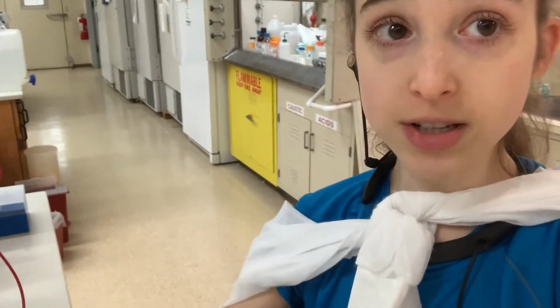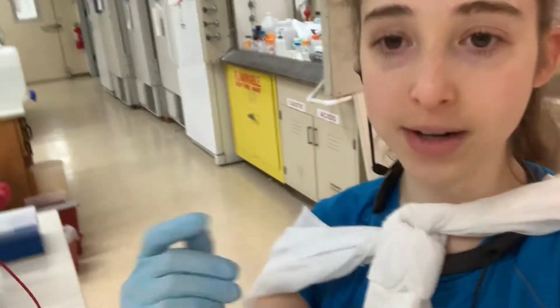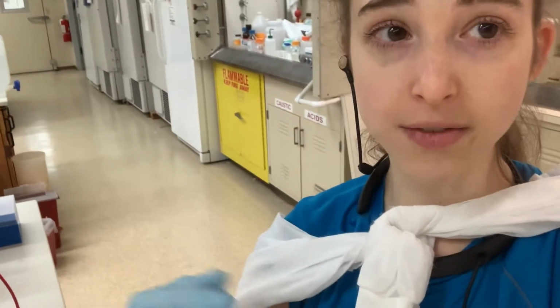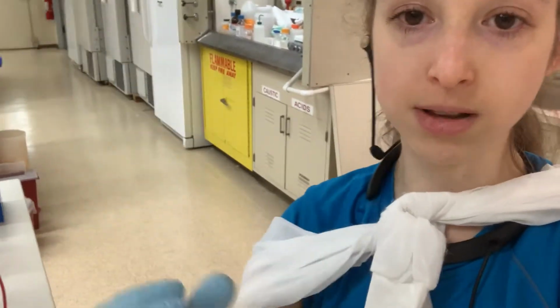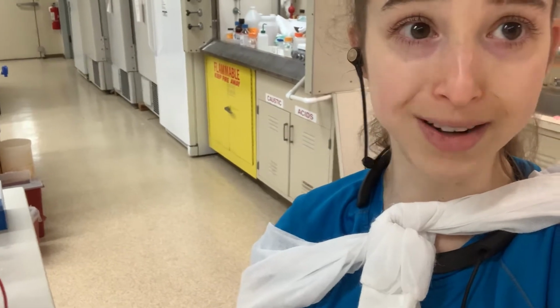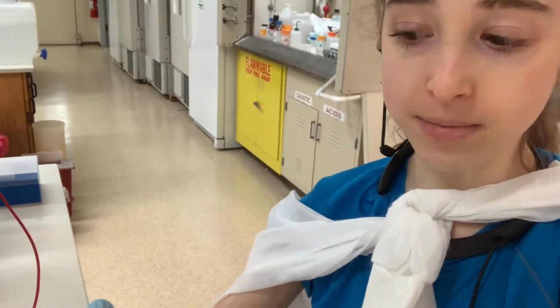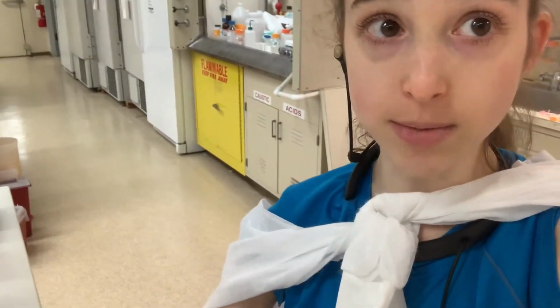So typically I'll add some and I'll let it dissolve, and then add a little more, let it dissolve, add a little more, let it dissolve. That'll also help with preventing it from clumping up and giving up trying to dissolve, it seems. You want to do that, make sure it dissolves completely, and then you want to actually get the correct measurement.